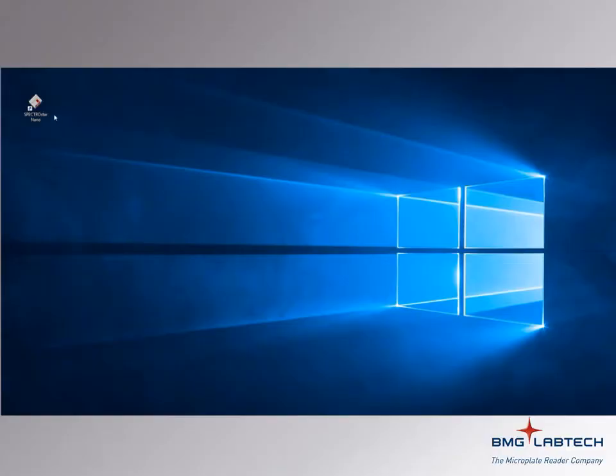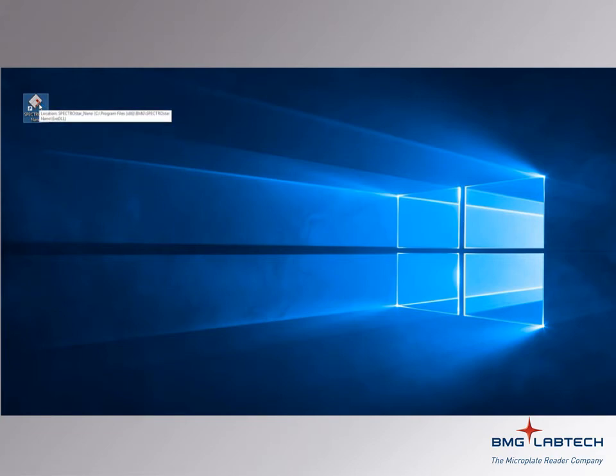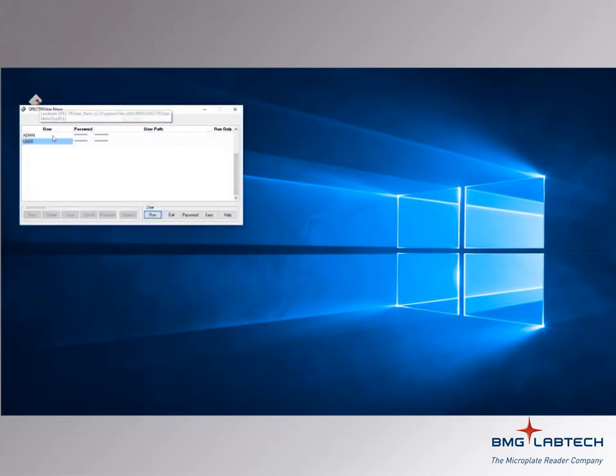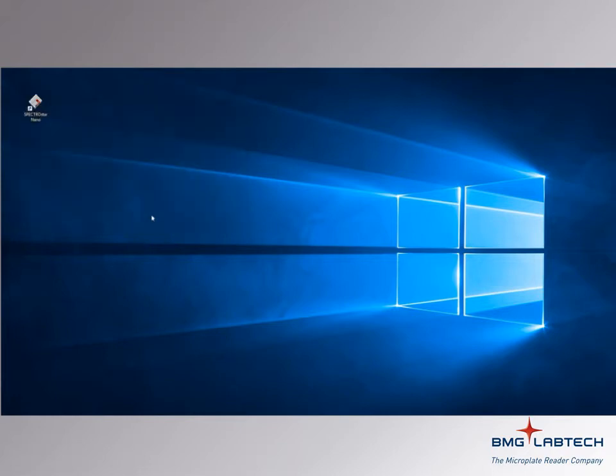The Nano software, once installed, can be accessed from the desktop icon. For most users, the standard user account will be sufficient. With user highlighted, you can select Run to access the software.